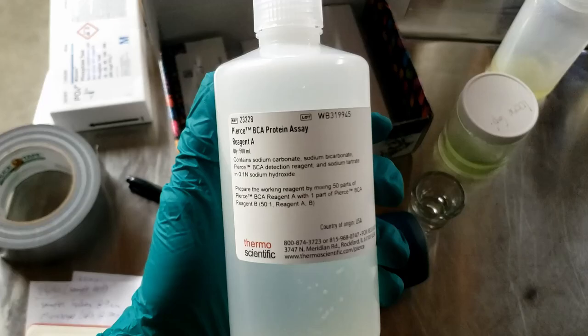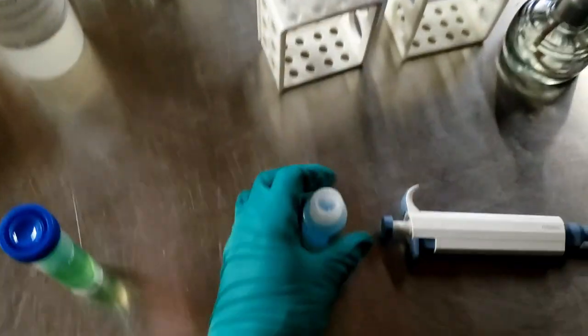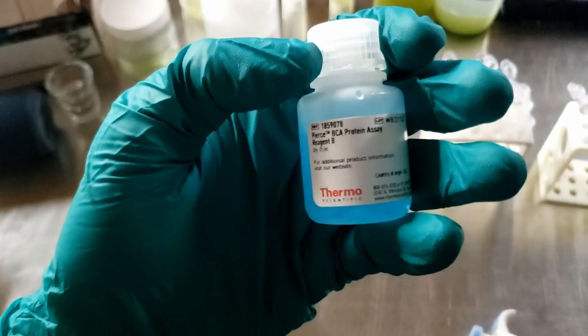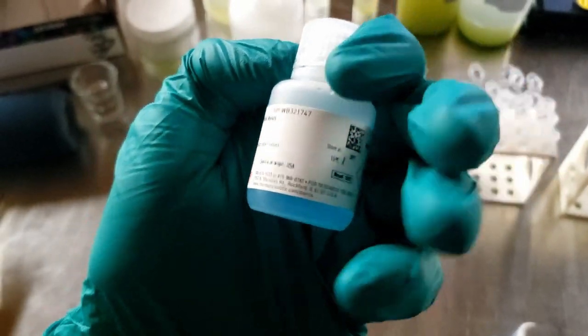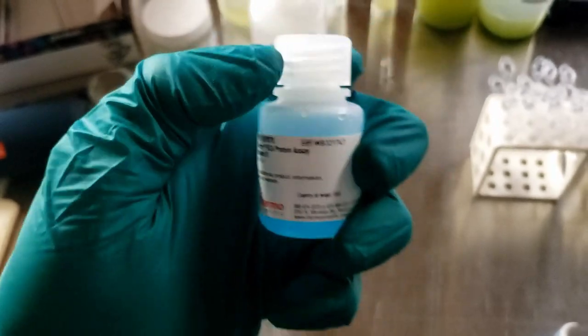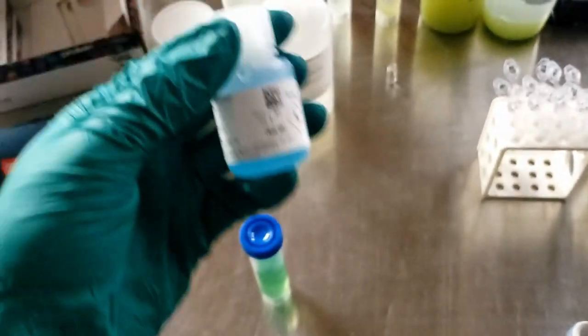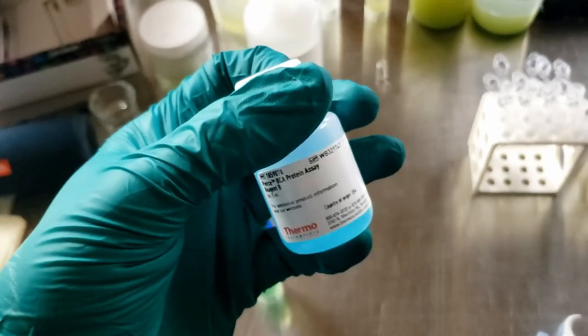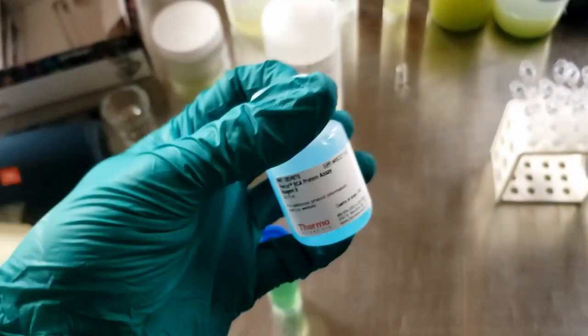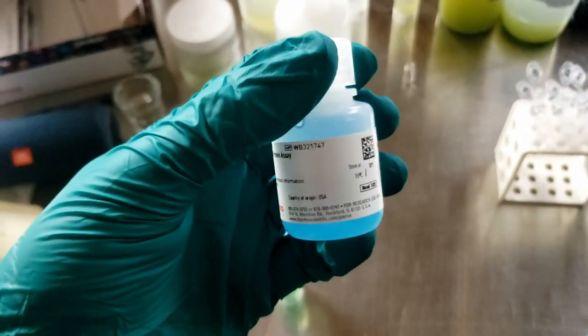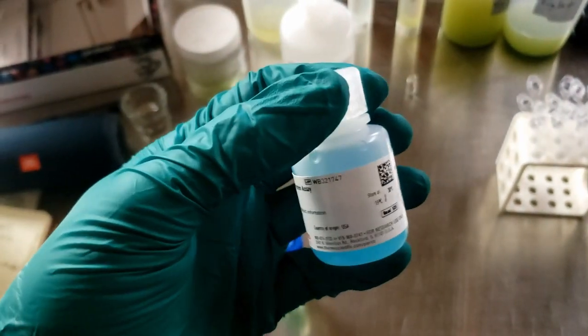Here is part A of the solution, and then part B of the solution is this. This is toxic, so when you dispose of it, you need to tie it up in a bag and double bag it essentially and throw it away. It's not extremely toxic, but it's not something that you want to pour down the drain or pour in your backyard.